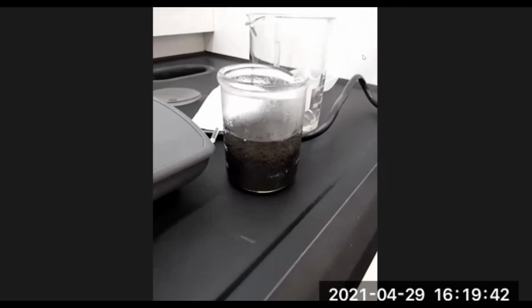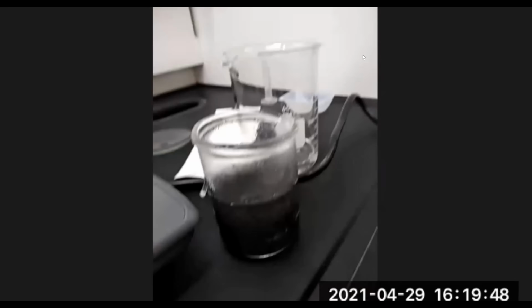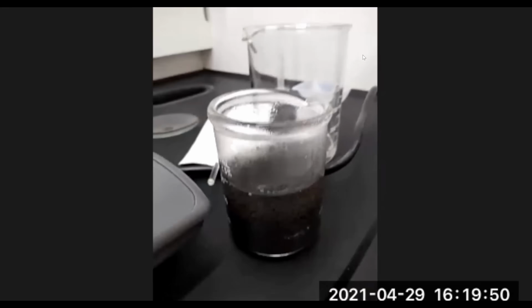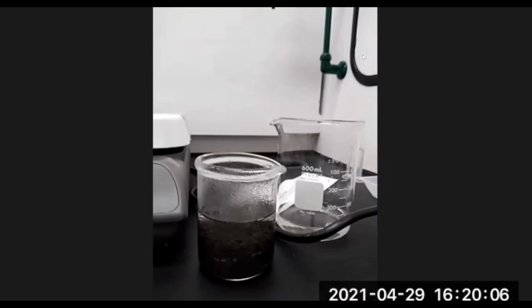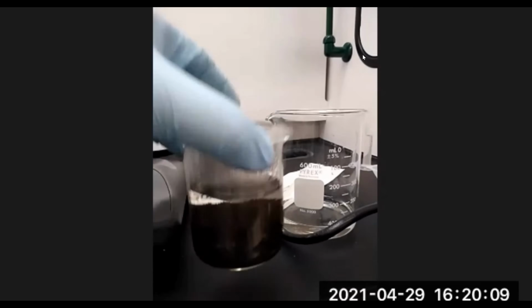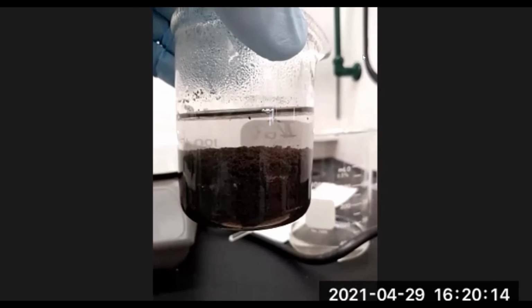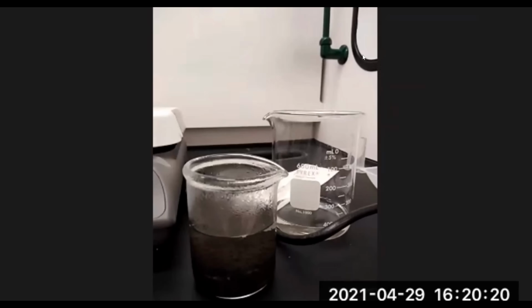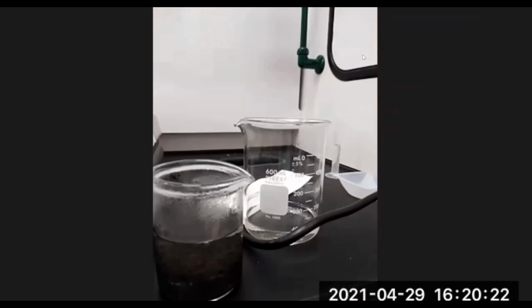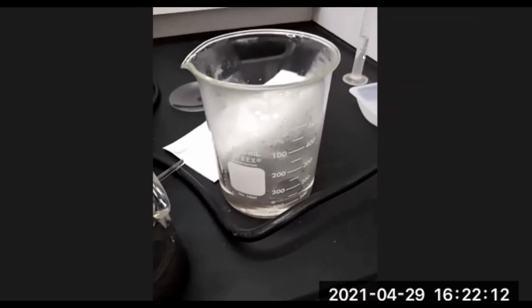So he added some hot water to the beaker there, and once it settles, he's going to decant the solution. So after several minutes, it's settled. You see there's a big gap between the top of the solution and the precipitate. So here you can pour out, decant some of it before using the dropper if you like. Or you can just get a dropper and start with the dropper at this point. But the student here decided to decant.